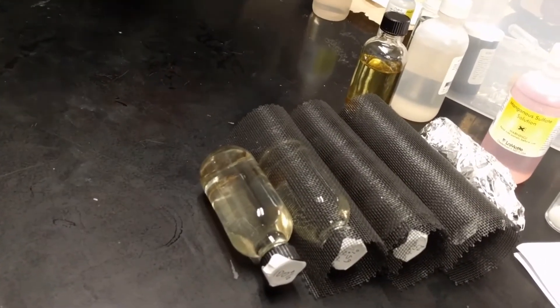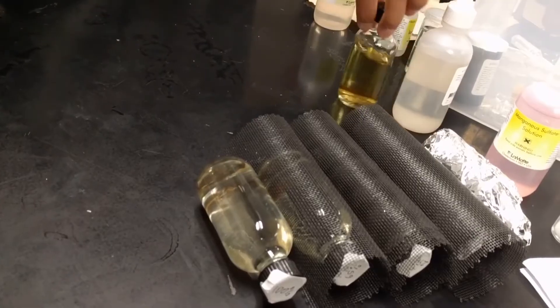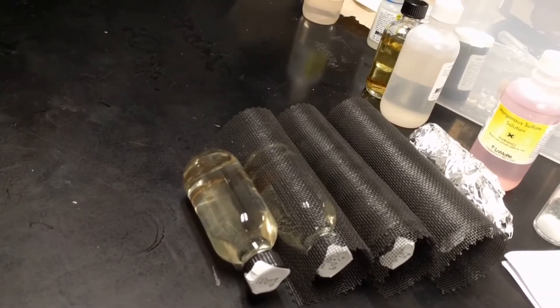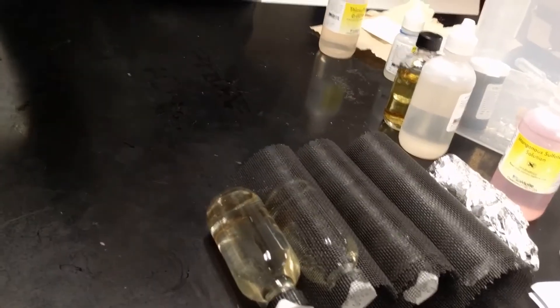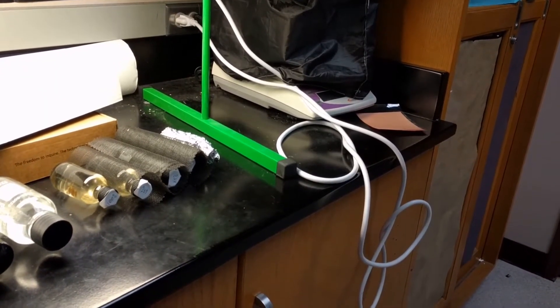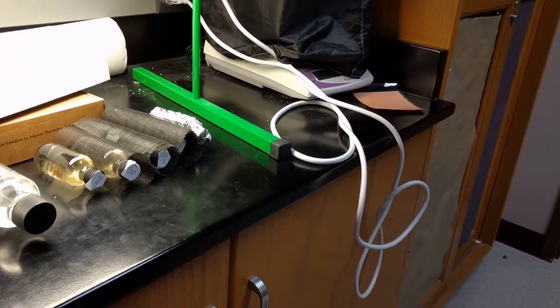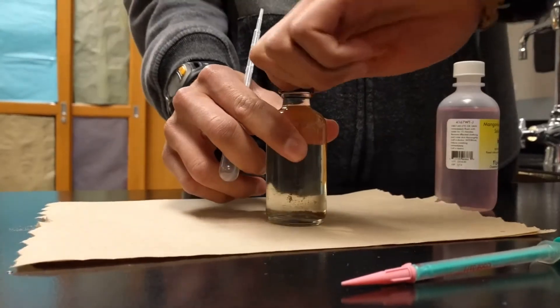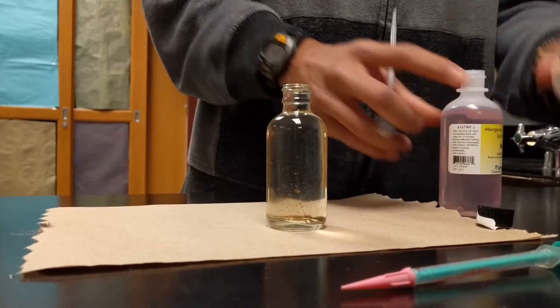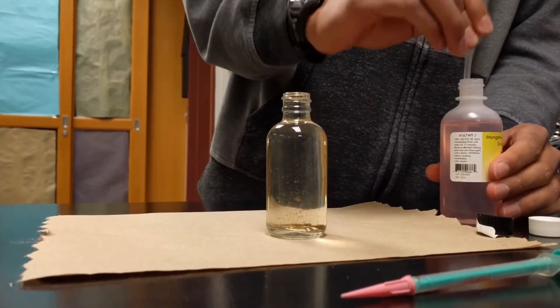We will leave these overnight and the next day we will measure the dissolved oxygen levels after treatment. It is important to make sure that we measure the dissolved oxygen levels and fix the oxygen as fast as possible.